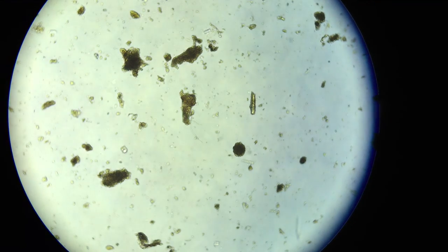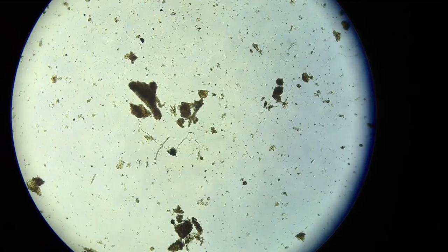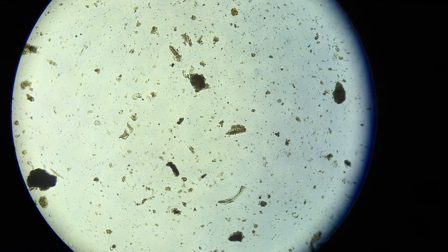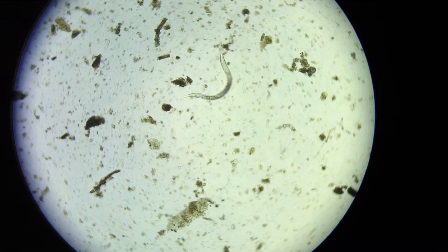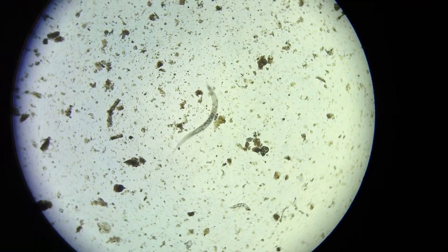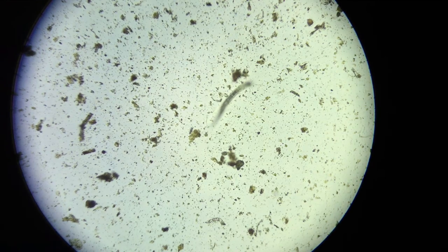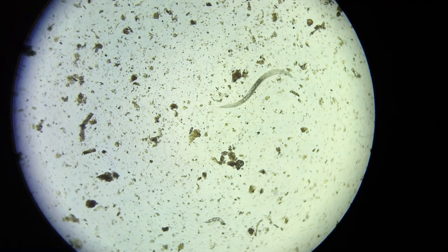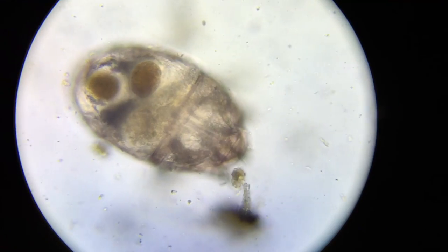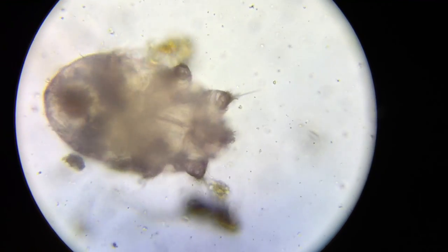At 400x, this is the one month old compost and this is generally what it looks like. This is the other compost — it's a 10 to 1 dilution, and the previous flyover was also 10 to 1. This is looking pretty much the same at 100x, but I did find this large bacterial feeder. This is a mite at 100x, and now it's at 400x in the one month old vermicompost from Lakeshore Vermicomposting.